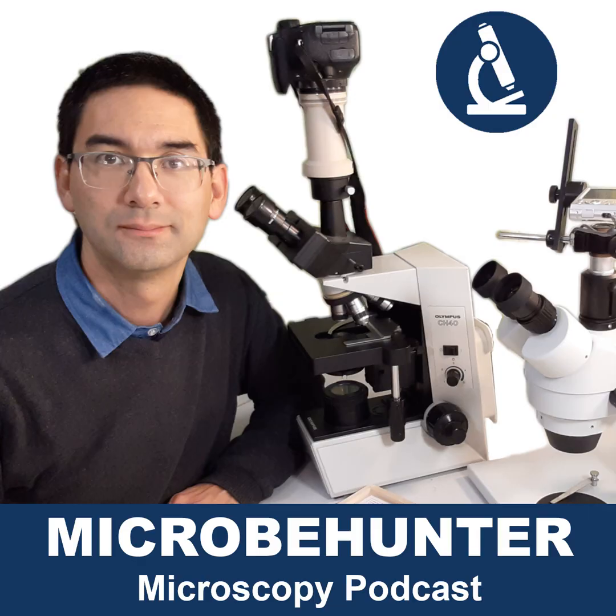I think the ability to take pictures is a very important thing, because it makes it much easier to document the things that you're actually observing. If you don't have a photo tube, you can still take pictures directly through the eyepiece using a pocket camera or mobile phone. This also works. So you're not excluded from taking pictures if you don't have a photo tube, but it's simply much more convenient if you have it.